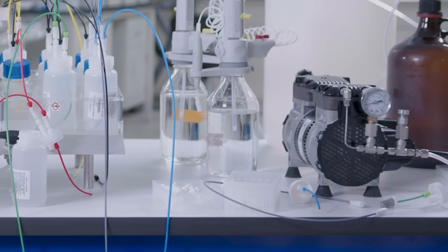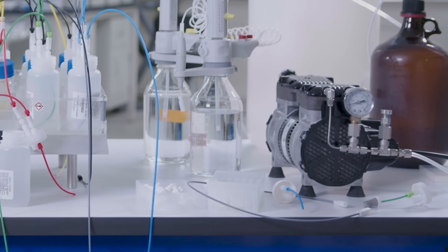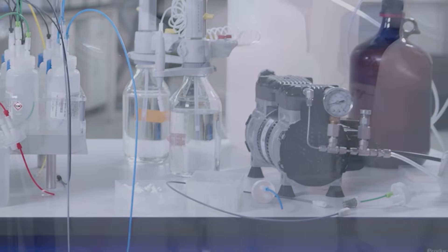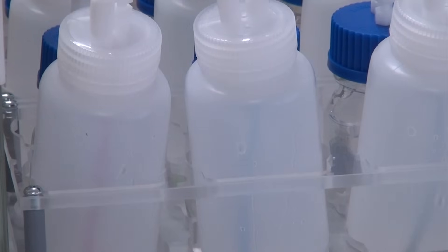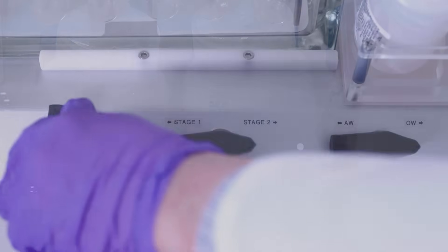Vacuum cartridge drying. Nitrogen cartridge drying or combined. Automated bottle rinse and dilution. In-line nitrogen extract drying.